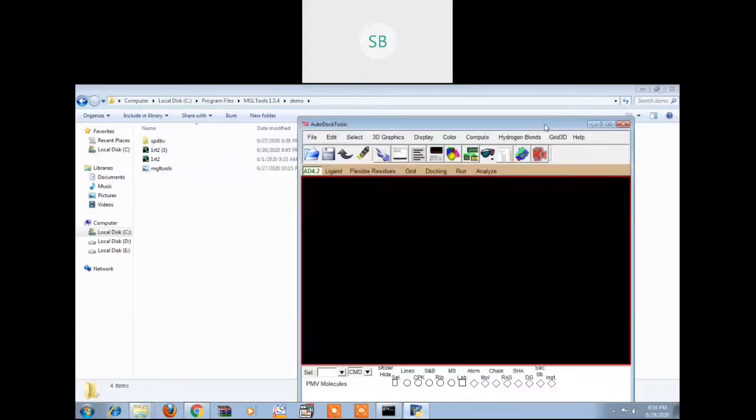And if we just want to carry out Autodock 4, if we stick to Autodock 4, this is the platform where each and every operation needs to be executed, right? But as I said, we are not going to use Autodock 4. Instead, the higher version, that is Autodock Vina, which is command based. It's not graphics based. It's command based, right? So that is why we are going to launch Autodock Vina here. We are going to deal with Autodock Vina.